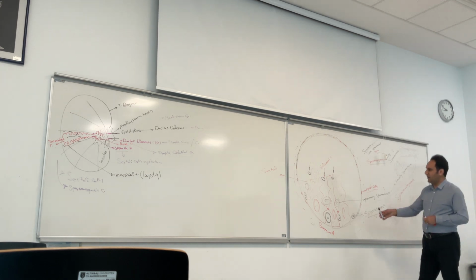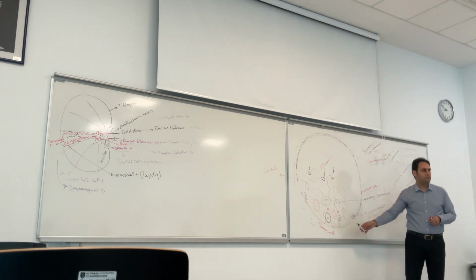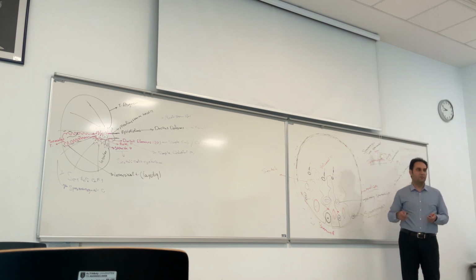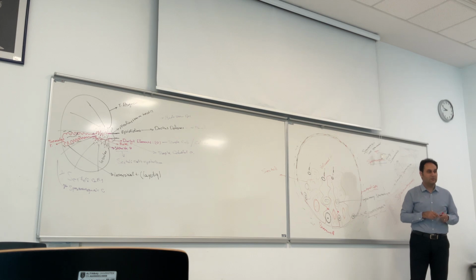Because in the wall of the seminiferous tubule we have different stages of meiosis division, you can't easily understand the shape of this epithelium. We consider this type of epithelium a special epithelium, or germinal epithelium.